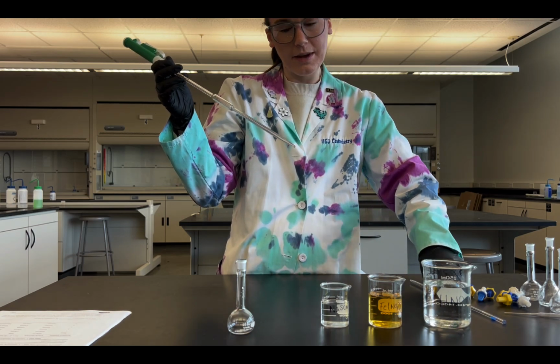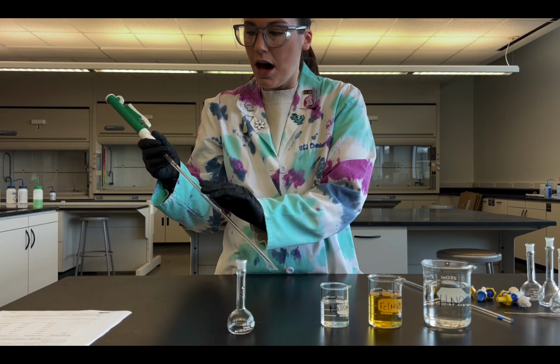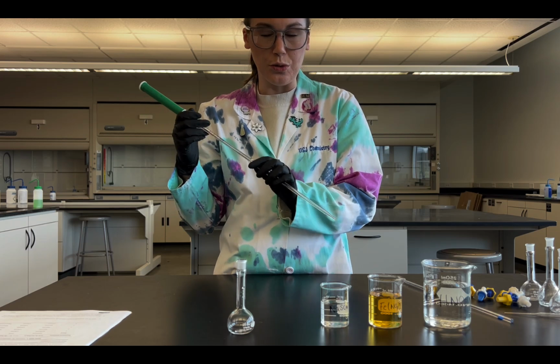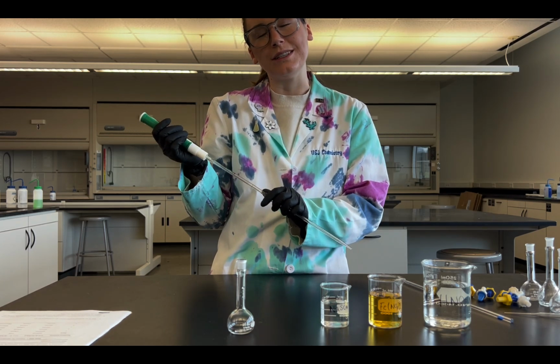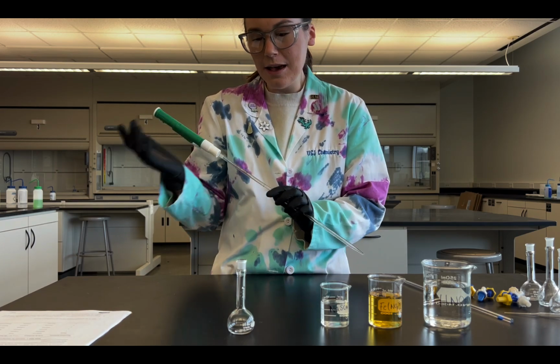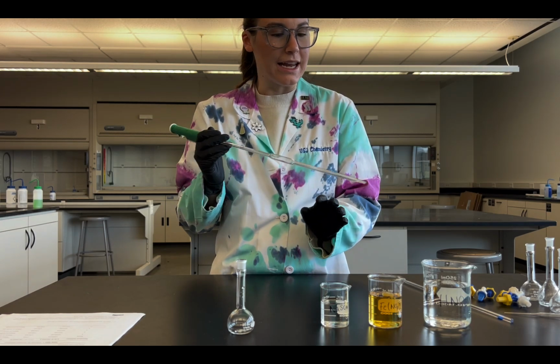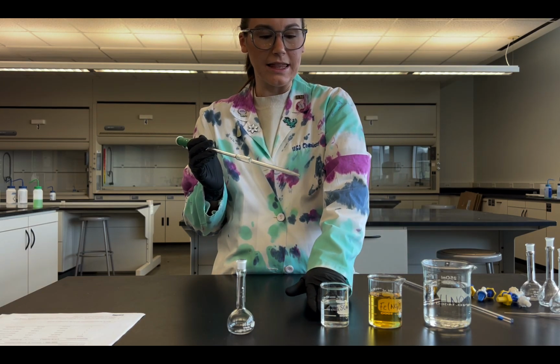What I'm going to do here is our first test tube. So I'll do the blank in the first test tube, number 1, and then I'll time lapse me doing 2 through 5, just because it's the same process, it's just different volumes, so there's no reason to sit here and watch me do that for 20 minutes. In order to make the blank, my chart says that I need to have 10 milliliters of iron nitrate, 0 milliliters of the sodium thiocyanate, and then I'm diluting the rest of the way with my nitric acid. So I'm not using any thiocyanate.